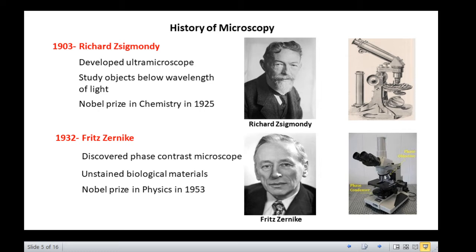But it took another 10 years to bring the first phase contrast microscope to market. Just 6 years after the invention of the phase contrast microscope came the electron microscope. As far as microscope technology goes, nothing is quite as impressive as the electron microscope.